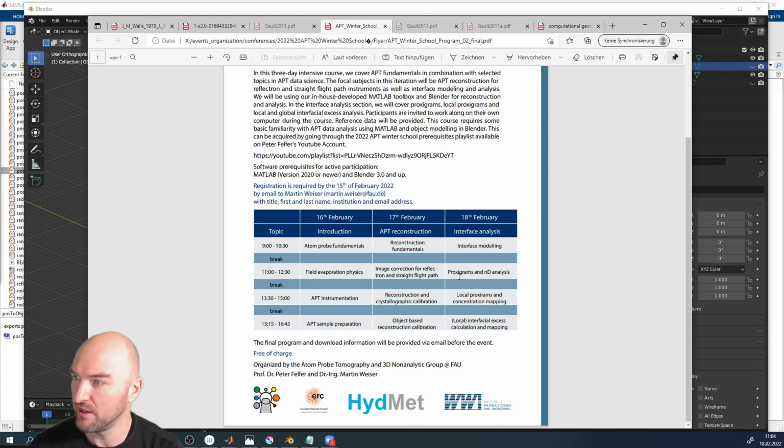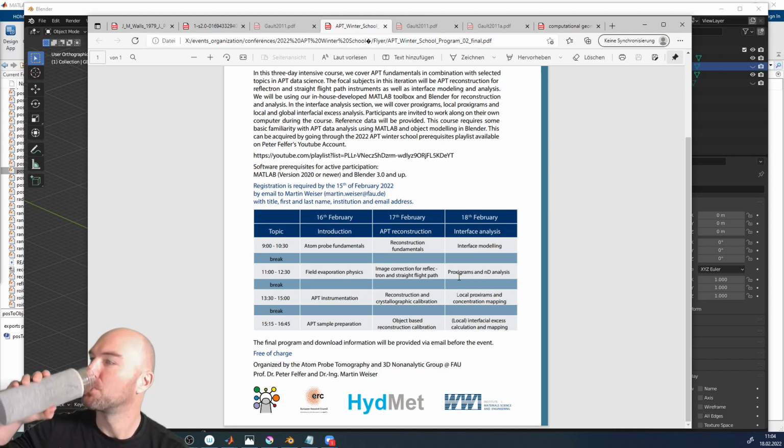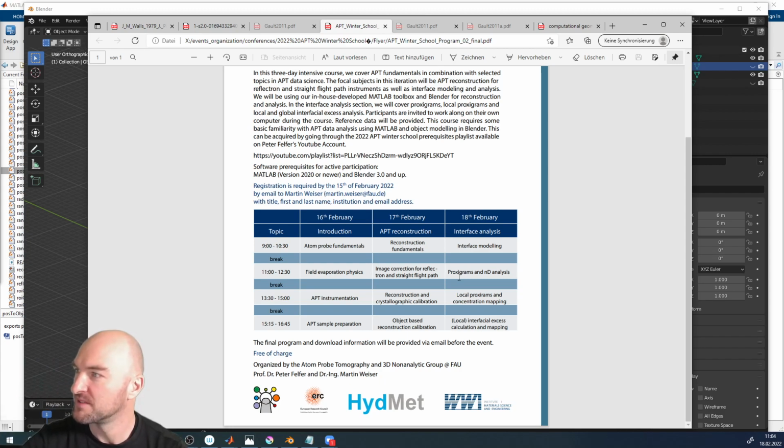So how many of you already have a grain boundary? Did some of you manage, maybe during the break, to create a grain boundary? Okay, that's one green tick more than before. All right, at least some people were able to create a grain boundary.